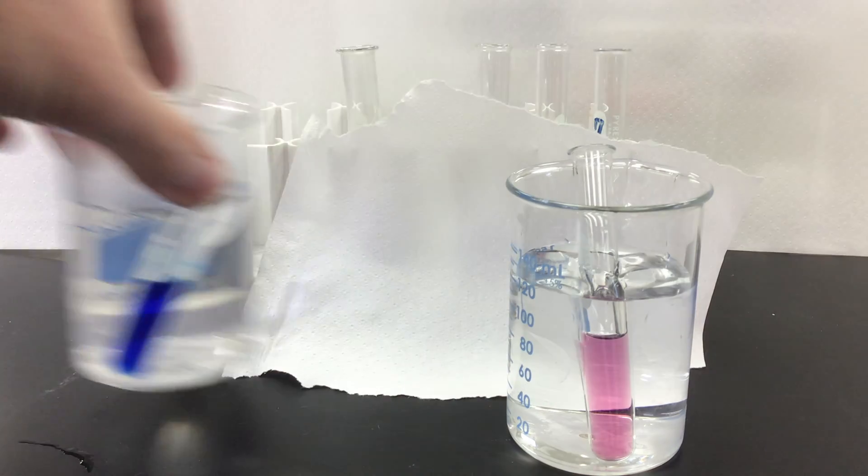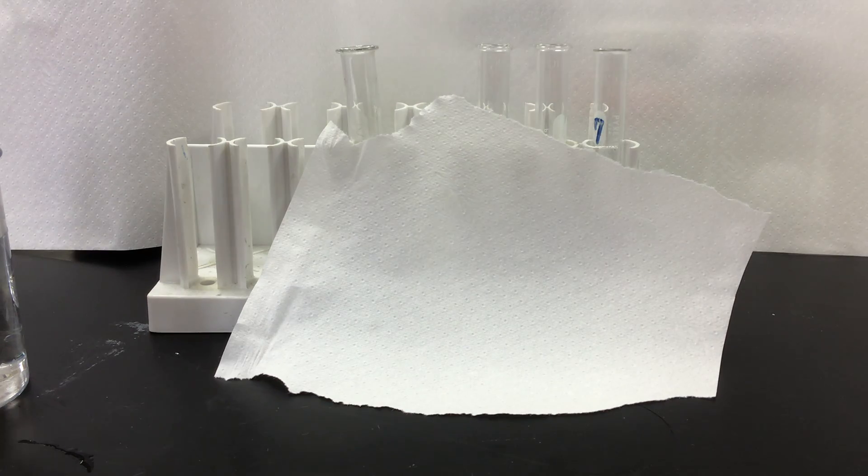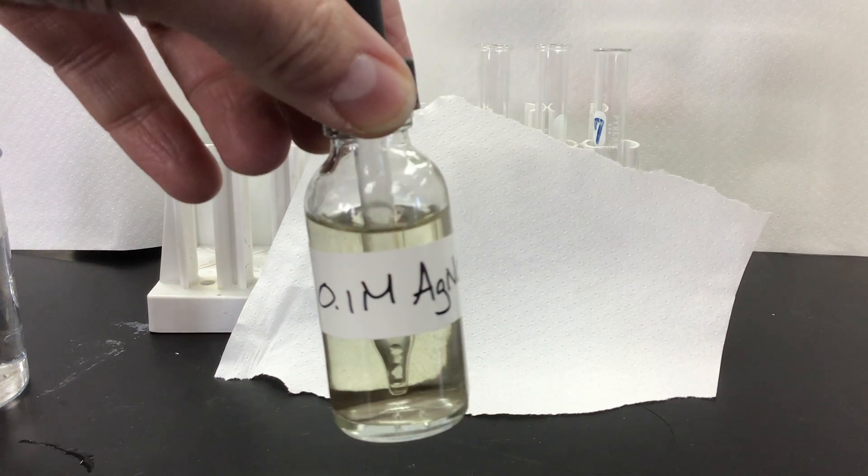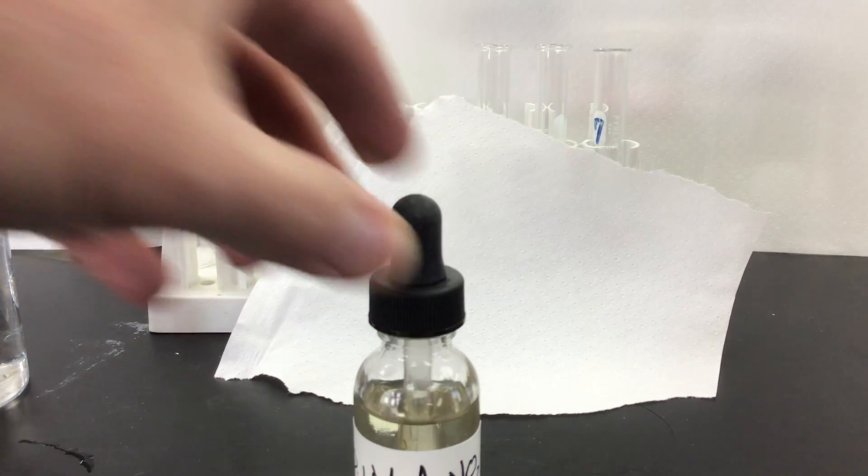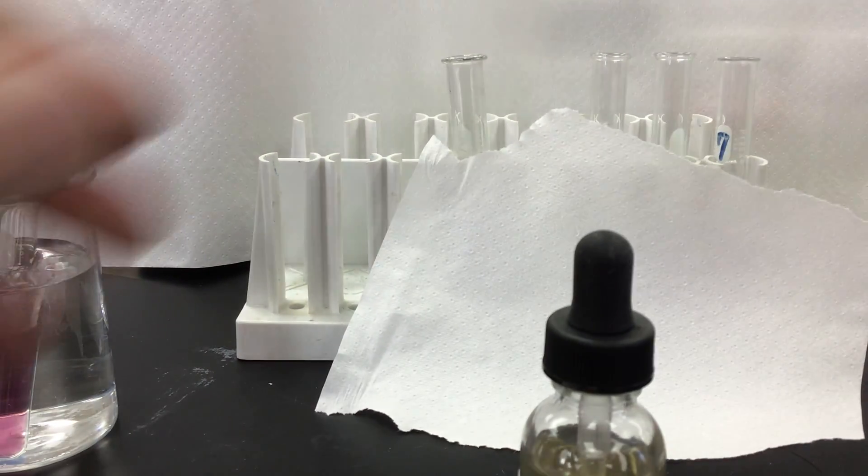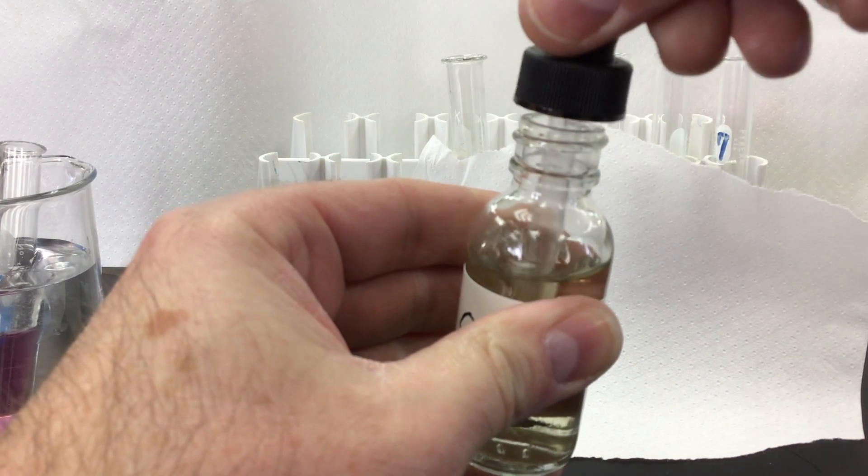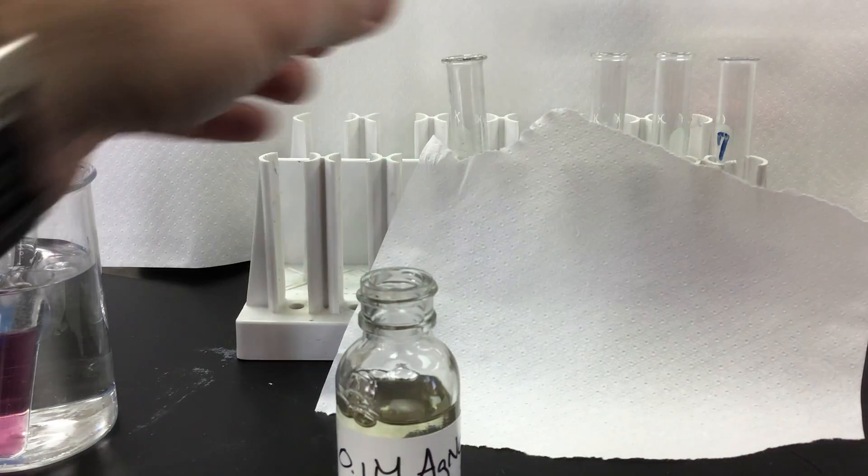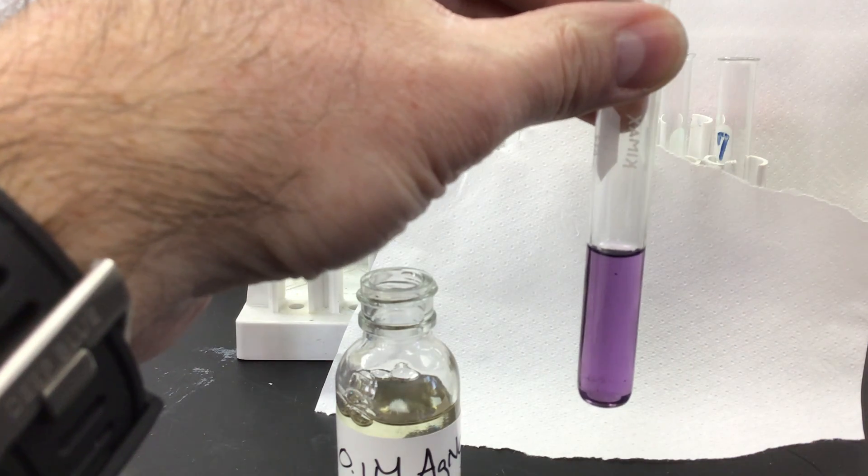Next thing we're going to do is we're going to take a look at what happens when we add some silver nitrate solution. I've got a silver nitrate solution here and we're going to add that to one of our test tubes and see how it reacts. Our method says we're going to add about five drops.